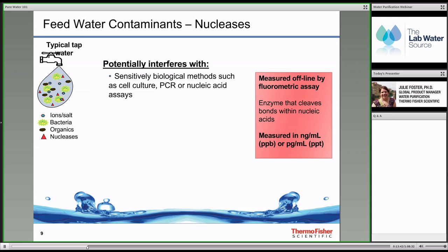And it can really be a huge problem for any applications in the molecular biology realm, because if it's an enzyme contaminant and it's degrading RNA and DNA, and you need those for your experiment, it's going to be a problem. So if you've ever had a blank PCR reaction gel, I know I've had them many times myself, probably you have some sort of nuclease contaminant somewhere, and water is suspect. You should think about that.